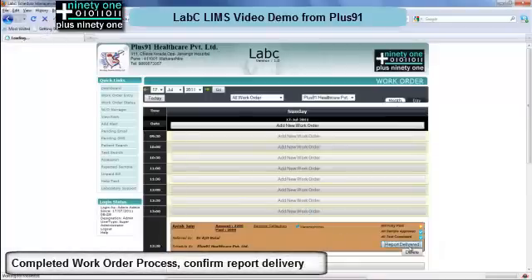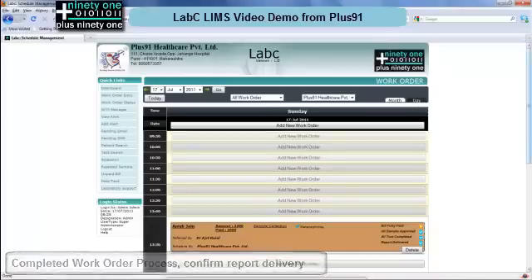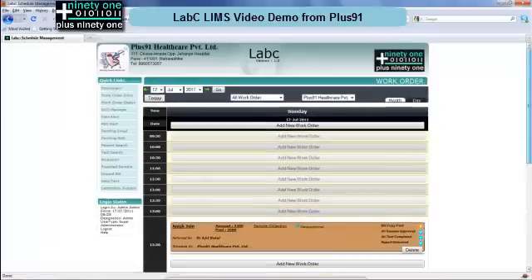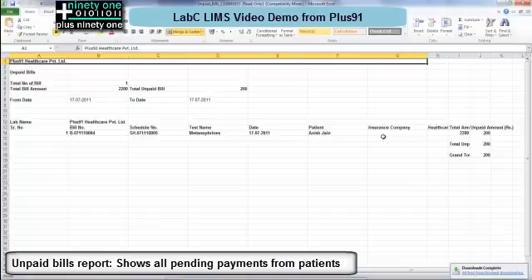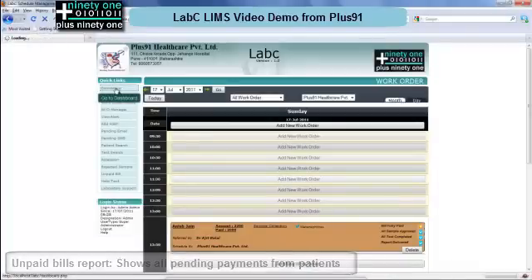Once the whole process is done it turns to brown. You can click on report delivered to indicate that the report has been sent to the patient. In case the bill is not paid, you can have an unpaid bills report which tells you which people have not paid and what amount. This helps to track your accounts.